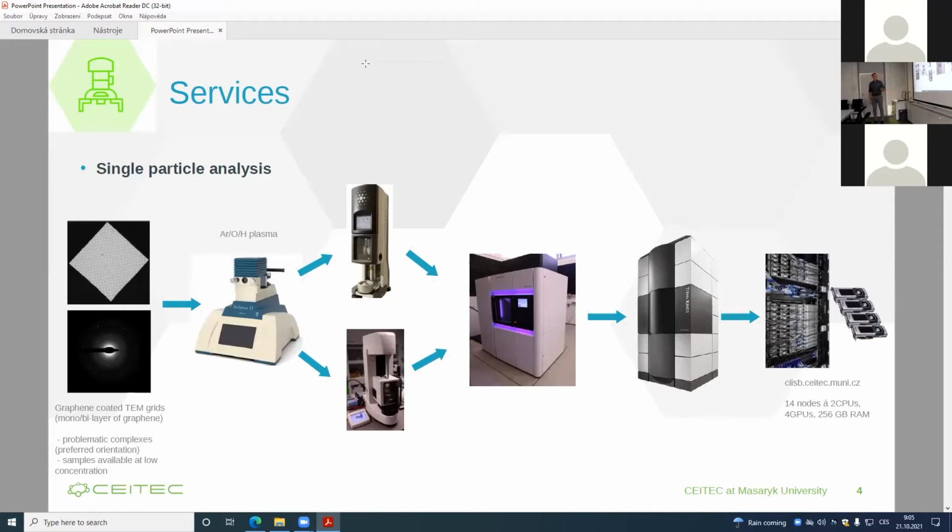So we recently bought a second vitrification device so that we can have a substitution and a slightly different technology for our users when our original plunge freezer is down, in order not to prevent our users from preparing their samples for the TEM.